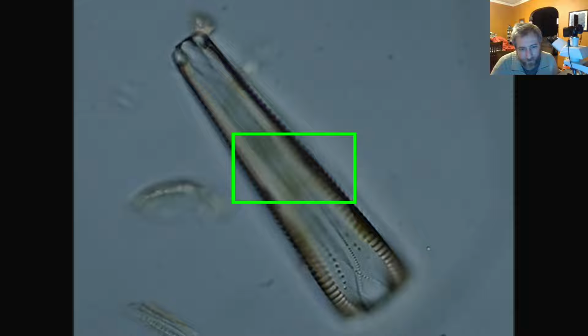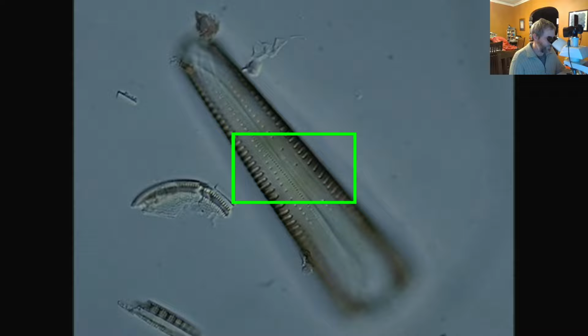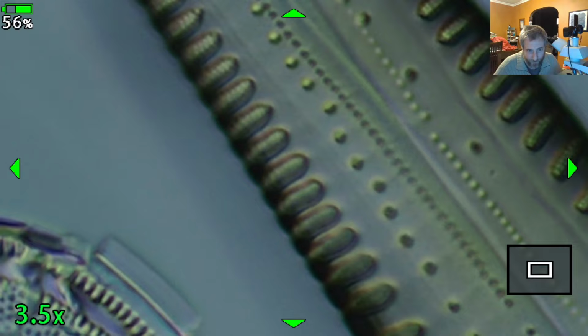Yeah, the two girdle bands are crossed. And you can see that they are not in the middle of the diatom. So this is actually a really interesting diatom for me, because it's got some weird structures. If we zoom in, one of the things we can see when we look at the striae, those little finger-like things coming over the sides, is that they're actually composed of two little rows. I don't know if you can see them very clearly, but for some of them you can see two little stippled patterns that alternate back and forth. We refer to this as biseriate.